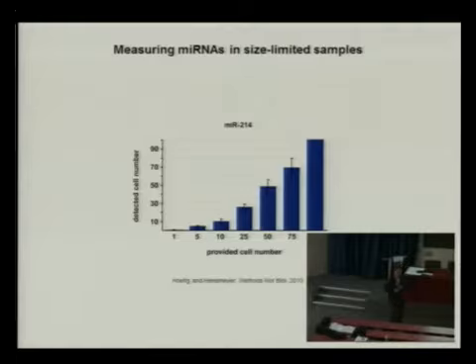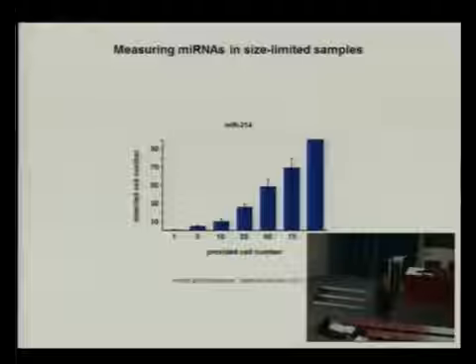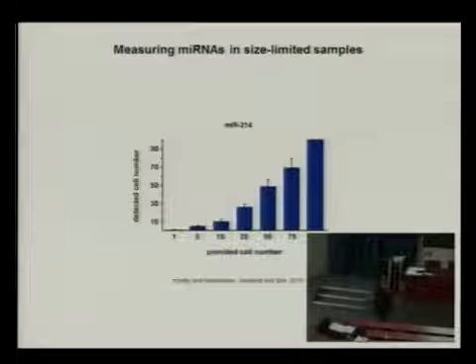And then the whole content, 100% of the content, is within the 5 microliters that you actually want to analyze, and you do then the first strand transcription, and after that the normal qPCR reaction. And it turns out the results that you get are what you actually would expect.